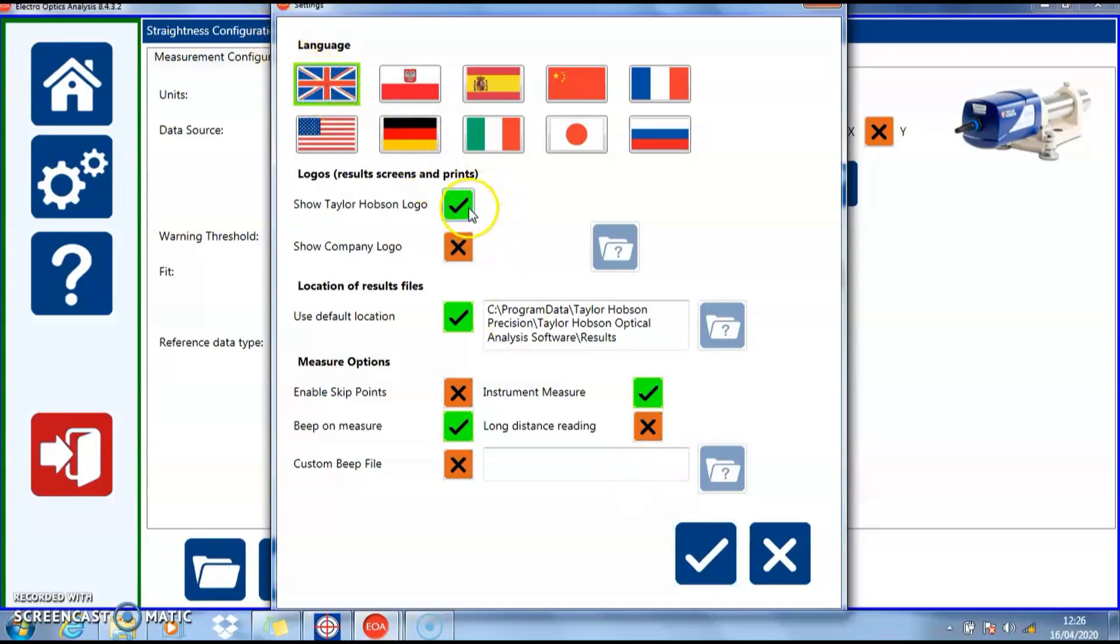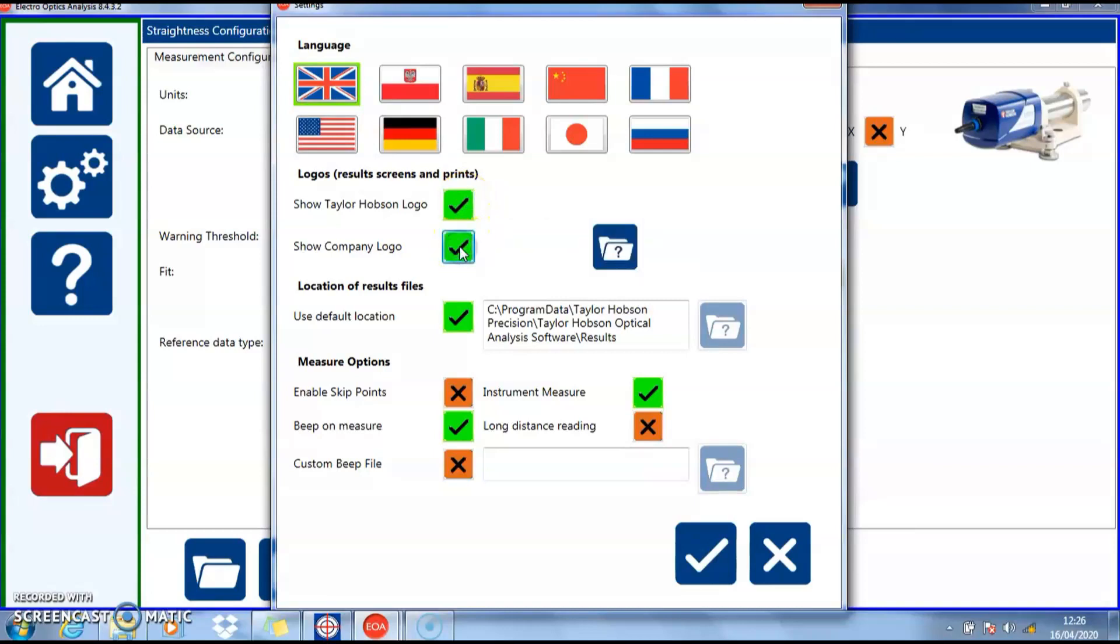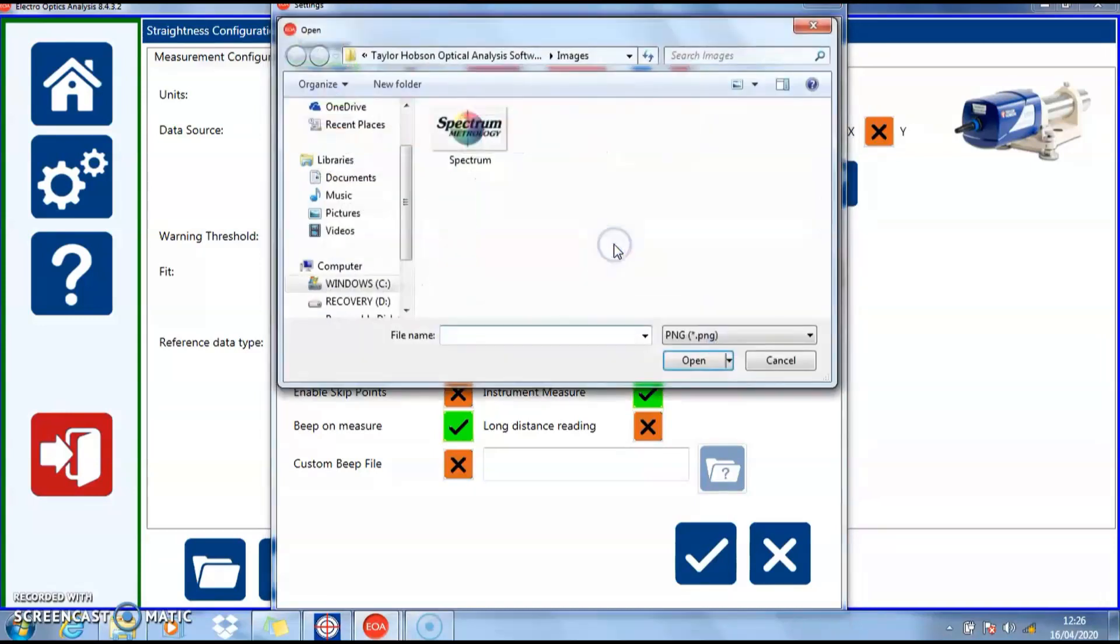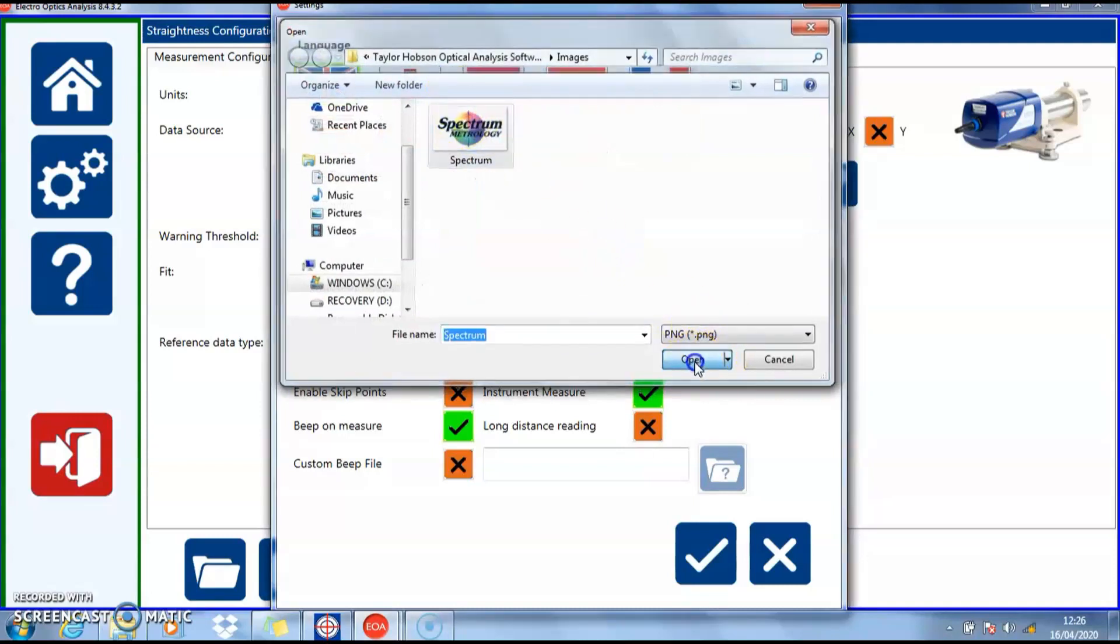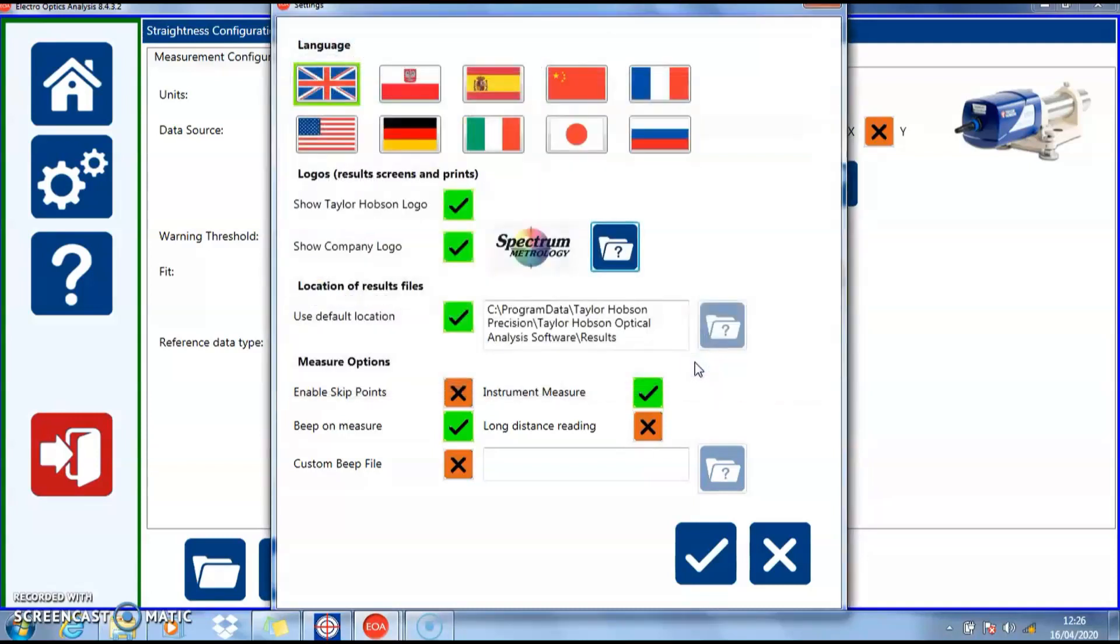We can show the Taylor Hobson logo on all results, or you may have your own logo you wish to show. Here we select the logo as a graphics file, and that will be inserted on all results pages.